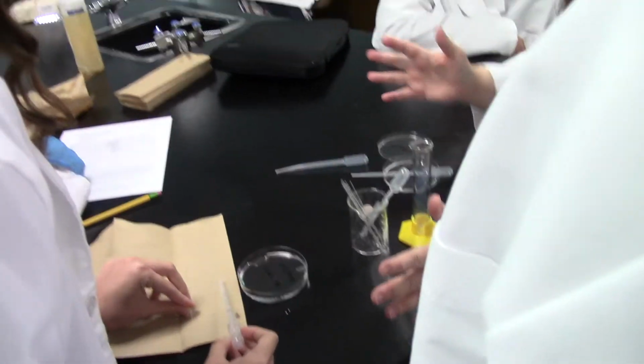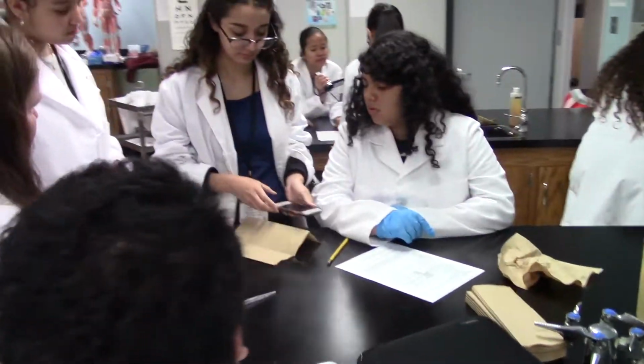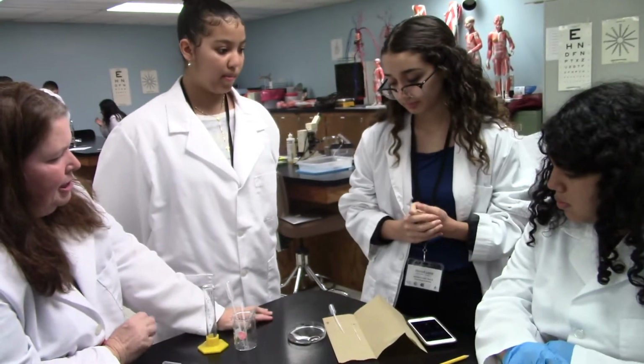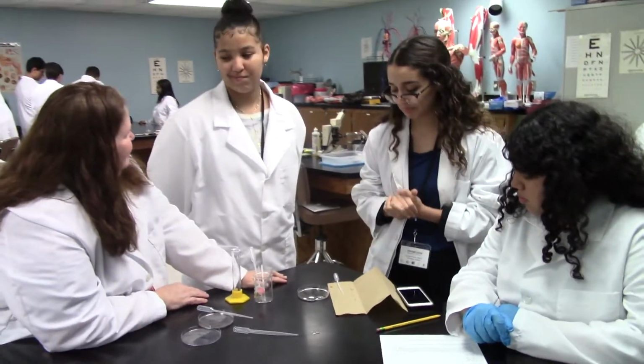So someone's timing. Oh, I forgot to tell you, timing 30 seconds. Coming out. Someone's timing 30 seconds. I'm leaving him in the sugar. You need to do the spring water, and then you need to put him in refined sugar, and you see the difference. Probably already had 10 seconds. Guys, we didn't count him.